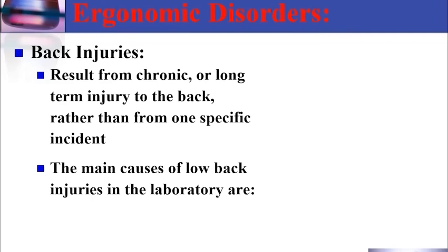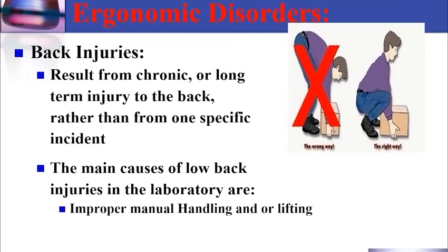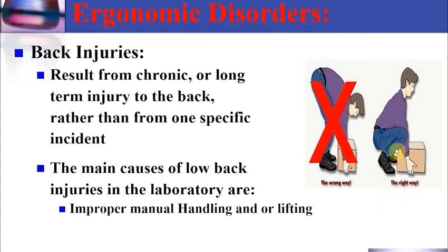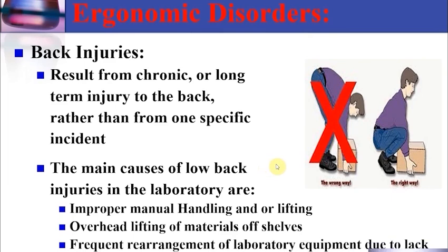The main causes of low back injuries in the laboratory are improper manual handling and lifting. The proper way is to use your thighs to lift heavy objects, not your back. Other causes are overhead lifting of materials off shelves and frequent rearrangement of laboratory equipment due to lack of space.